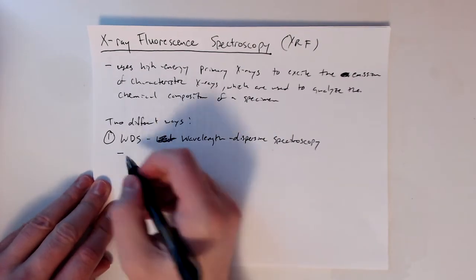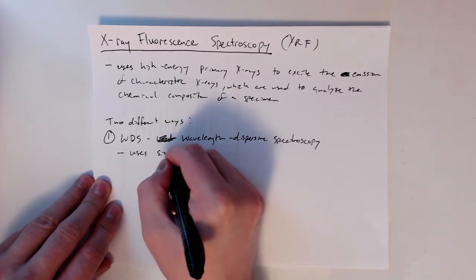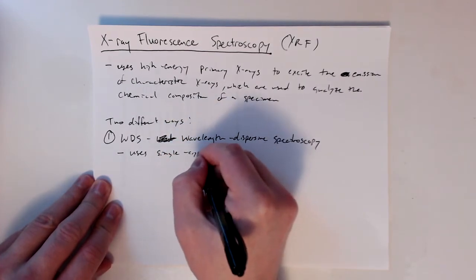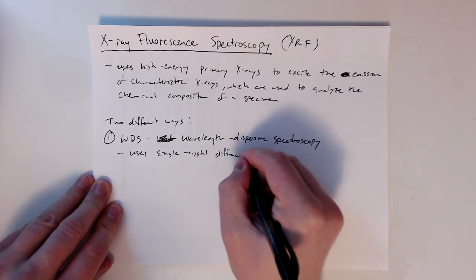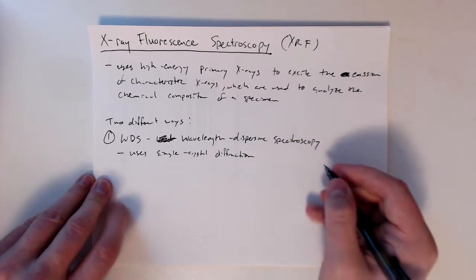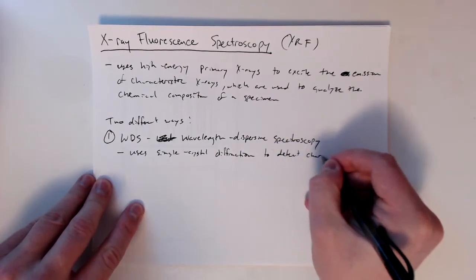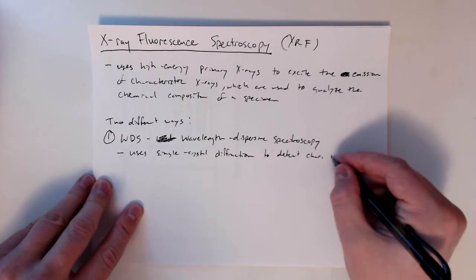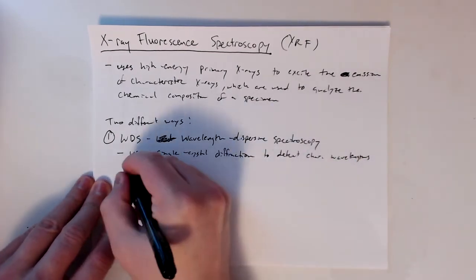And this technique uses single crystal diffraction, what we've talked about with XRD, to detect characteristic wavelengths emitted.